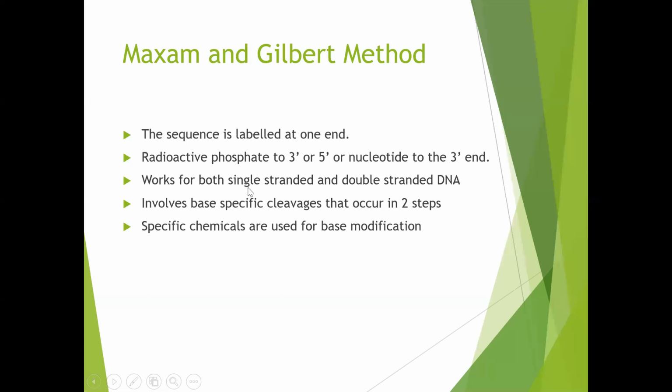This method involves base-specific cleavages which occur in 2 steps. In the first step, specific chemicals are used for base modification. Once the bases are modified by these specific chemicals, then those modified bases are cut by the usage of piperidine.